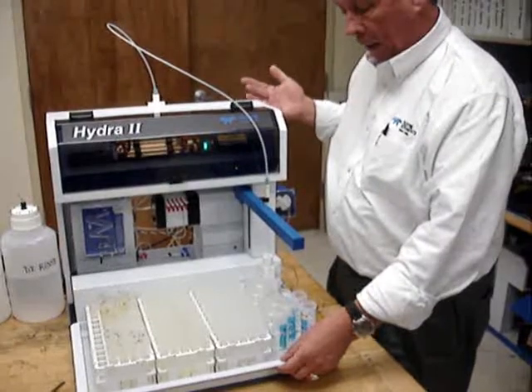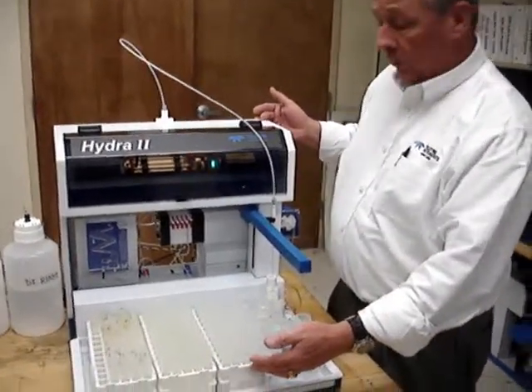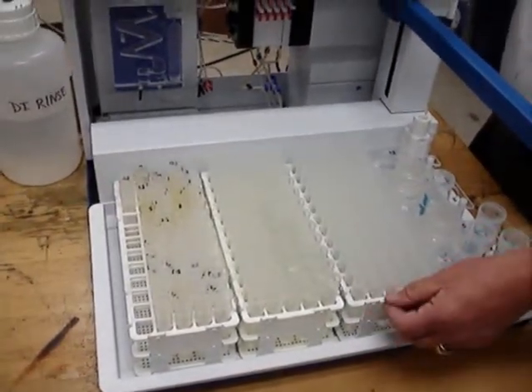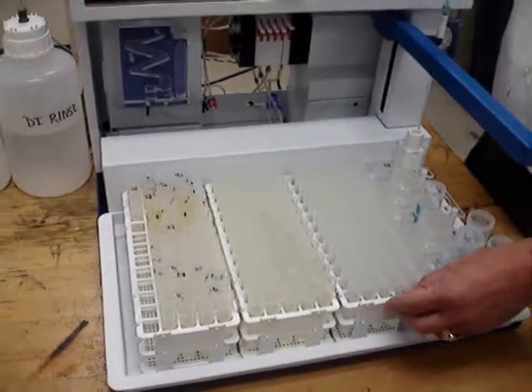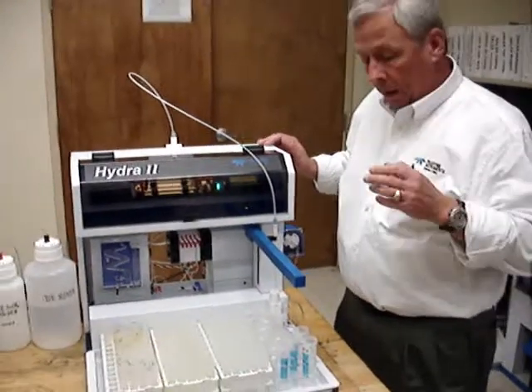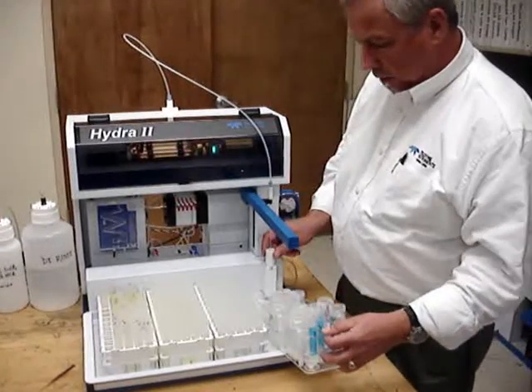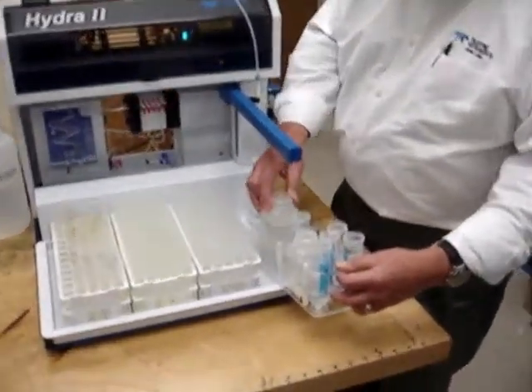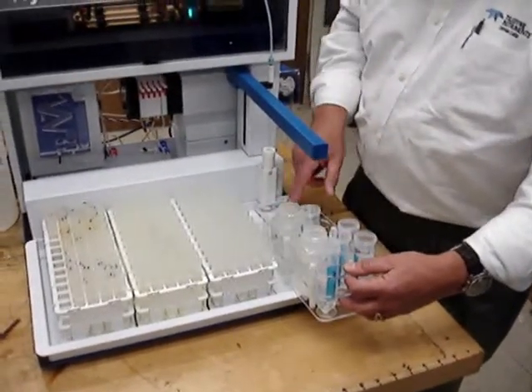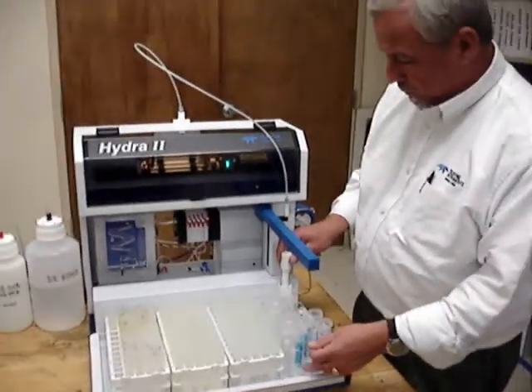It has a lot larger capacity — capacity for three sample racks, each holding a maximum of 90 samples. The one we sell originally is a 60-sample rack for a 180-sample capacity. It has a special standards rack with two large locations for continuing calibration solutions, as well as ten other locations for standards.